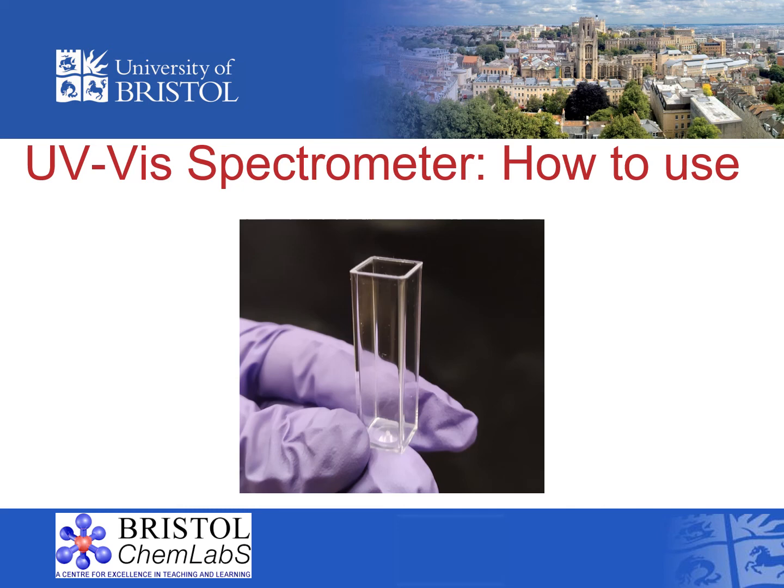This is an image of a clean and empty plastic cuvette. The far UV wavelengths of light are absorbed by the plastic of this cuvette, therefore a quartz cuvette would be required if analyzing this area of the spectrum.